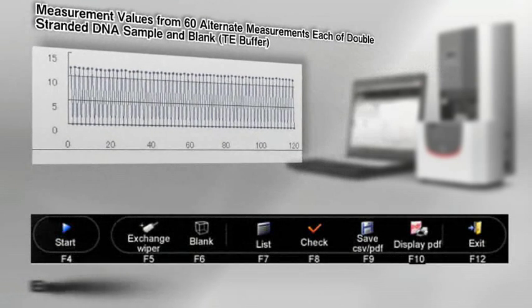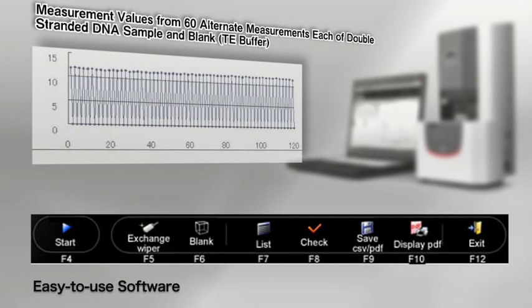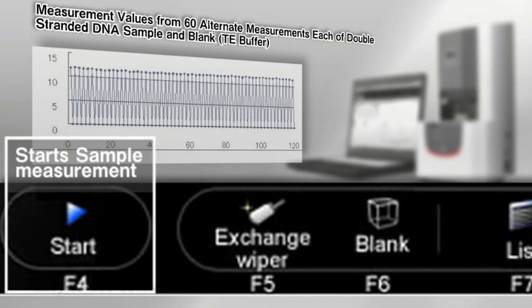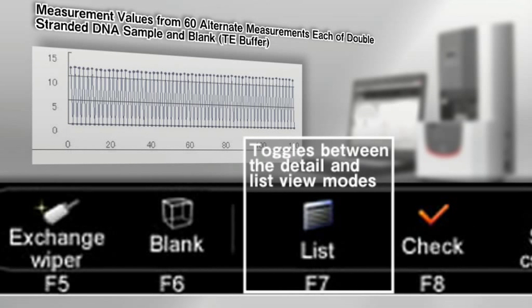Basic operations can be conveniently performed by clicking icons in the software or function keys on the instrument itself. Start measurement. Detail and list toggles between the detail and list view modes. Detail displays the analysis results and spectrum of the sample currently selected. List displays the analysis results of all samples in a table format.